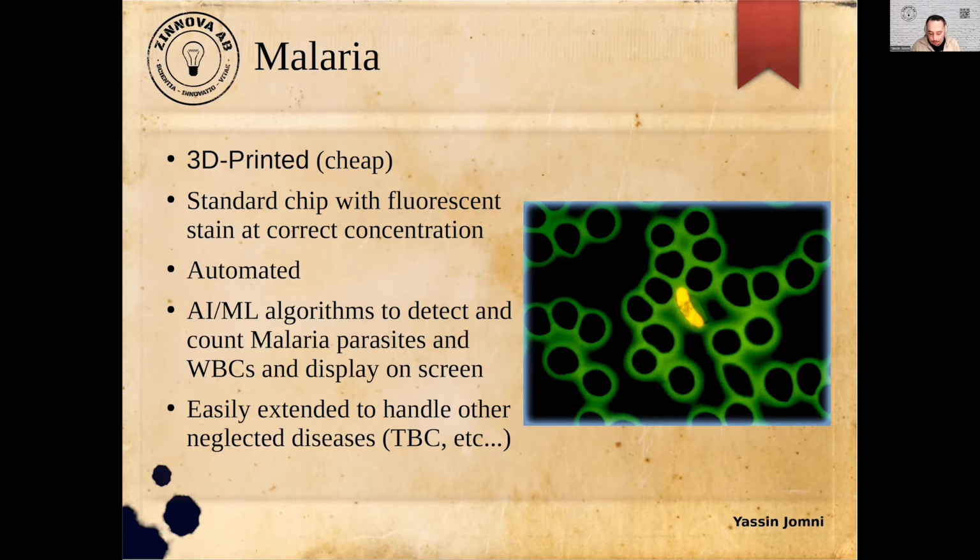But my idea is that one could make a cheap or affordable 3D microscope, because the biggest problem, for example, in Africa, is that there is not enough money, or the financing is not very good. So it should be cheap. It could be 3D printed, and the stuff that you cannot 3D print, you just order, and then anyone could put it together. It shouldn't be very hard to put together.